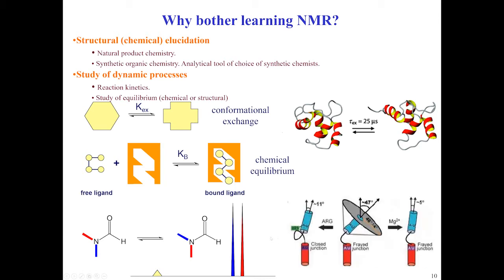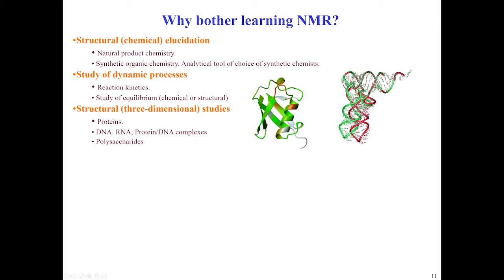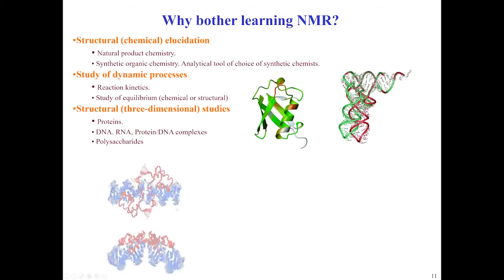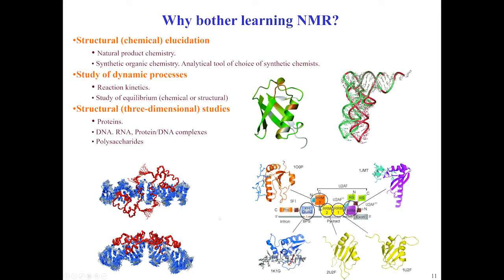And all this then brings us to more and more complex problems, trying to understand some biological phenomena and go along. A little bit mentioned that high resolution NMR studies started in the 80s with studies of smaller proteins. That's still an active area of research, also in the nucleic acid field. Understanding interaction and structural details. You have a piece of DNA and a protein bound to it. And then, of course, this again gives us intricate details of a given process here, intron excision, but that's not the most important, just to give a little bit of flavor of what we can do.